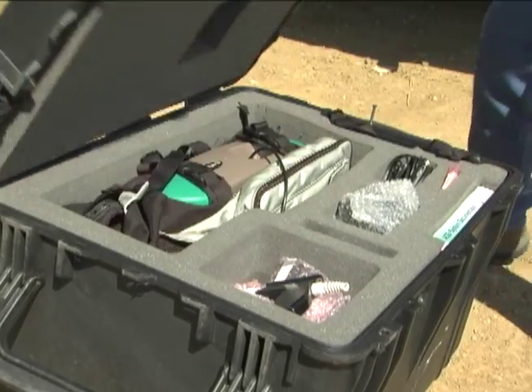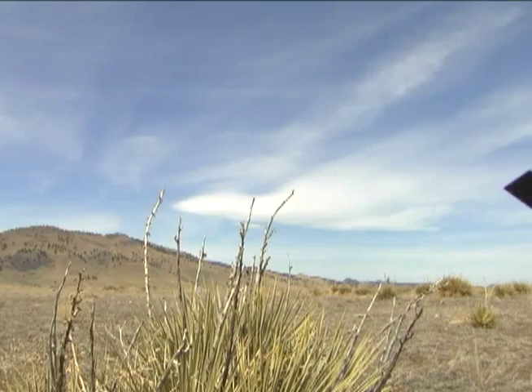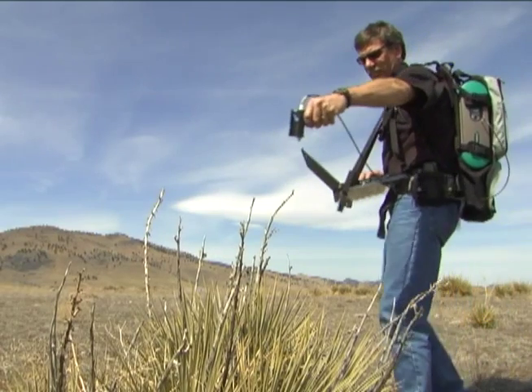We're very proud of the fact that our instruments arrive with the customer in a rugged case. It gets shipped across the country and you can flip it open, turn it on, and run with it right away in the field. You can pack what used to be a 150-pound laboratory instrument into 12 pounds, and it does the same thing — it's the same quality of result.